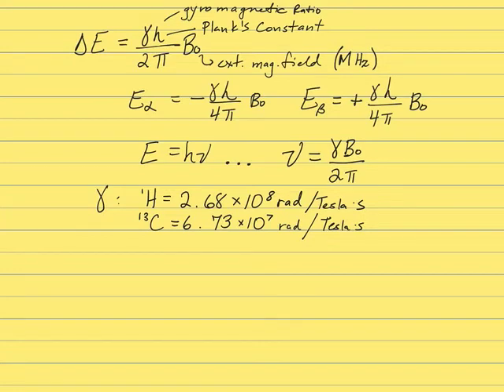An additional equation we can look at looks at the distribution of spins between these two energy levels. There is not a huge difference in the distribution of spins, generally speaking. Although I drew a few more with the field than against the field. That's how it works out. There's a few more with than against. It's not a drastic difference.